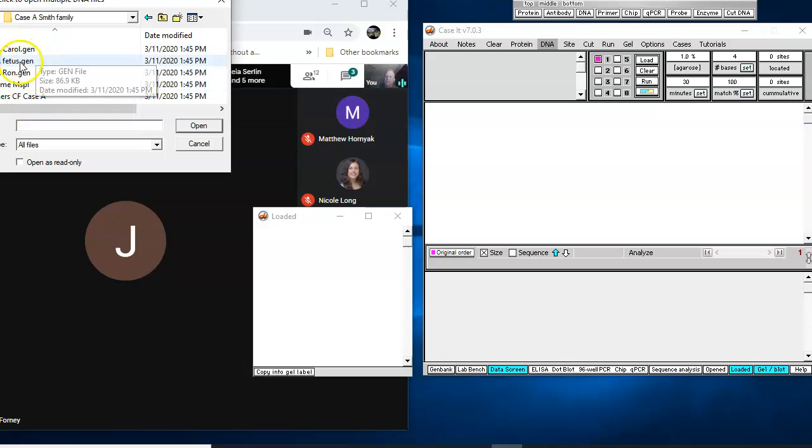And so that'll give you the genotypes of the parents and their fetus, which is why you would do this, right? So this is for genetic diagnosis. So I just figured that's better than doing just control DNA. That's kind of boring.